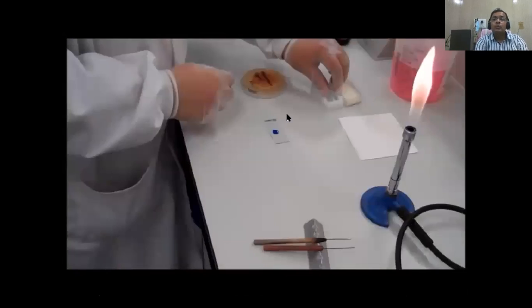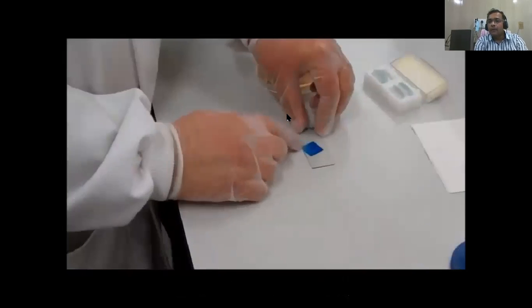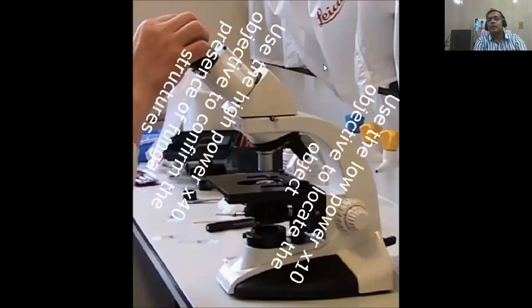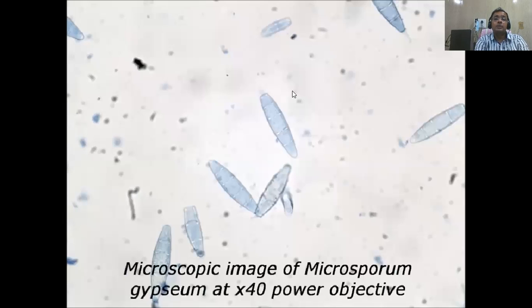Now you have to put a cover slip over the mixed material in such a way that no air bubble gets trapped. If you feel there is excess cotton blue stain, you can take out some stain with a filter paper or by some other method. This is a simple procedure by which you can stain your slide and go for observation under low power, then you can go for high power. This is the procedure by which we can observe the fungi, like this, at the end of your staining procedure.